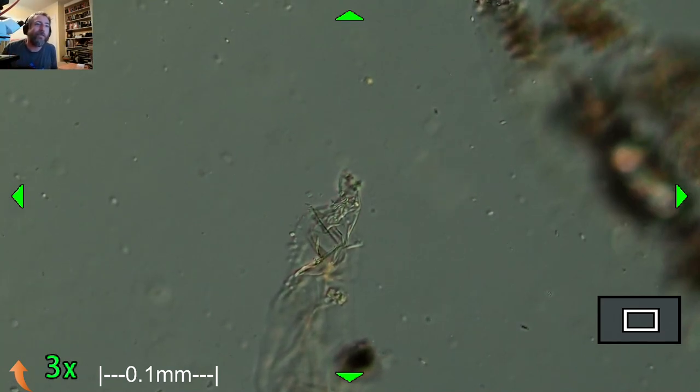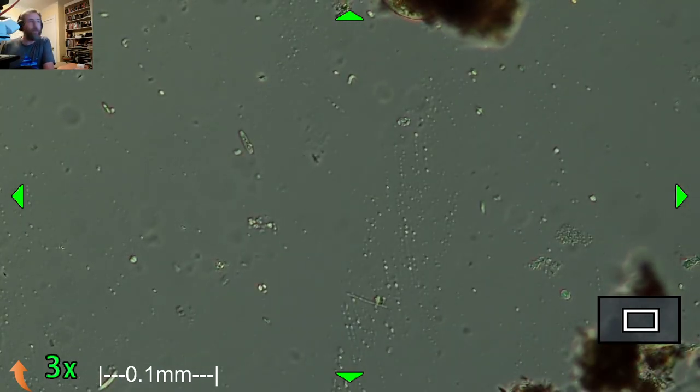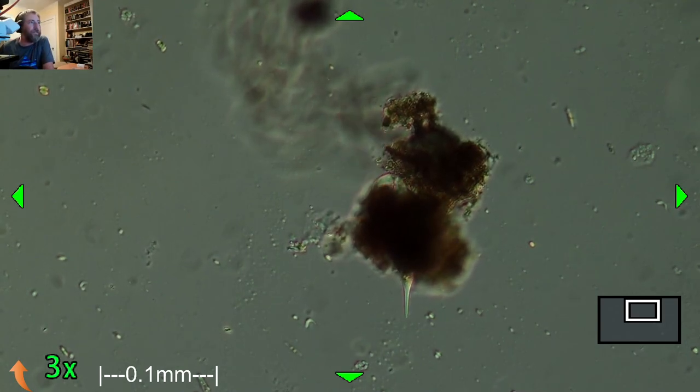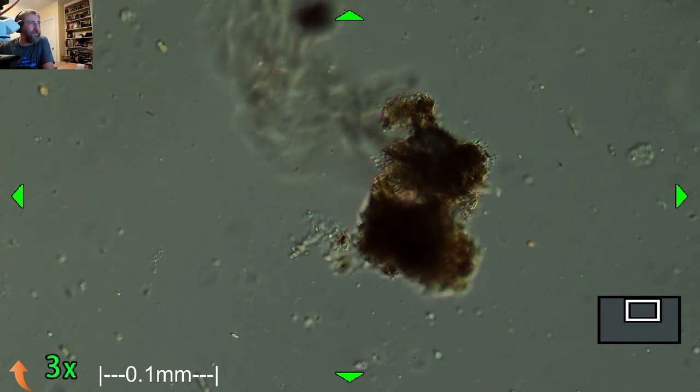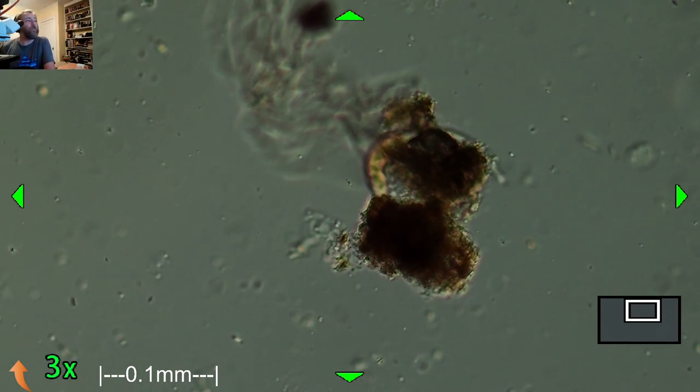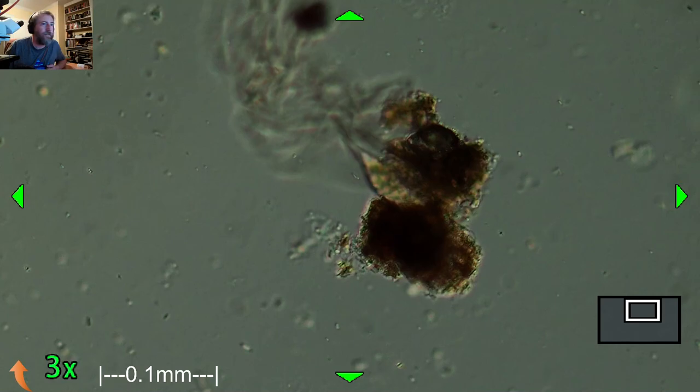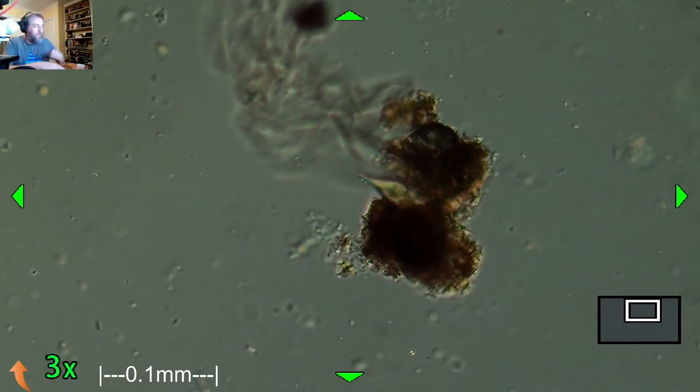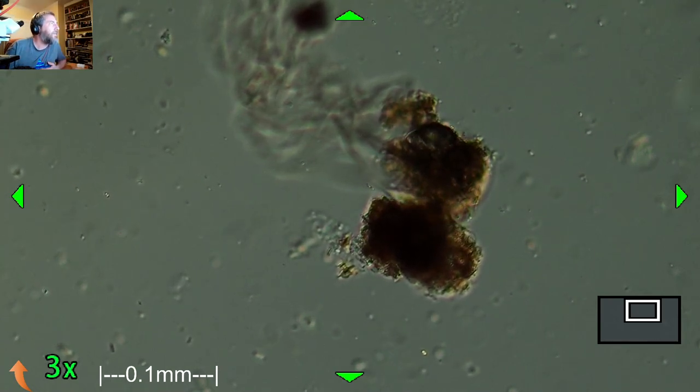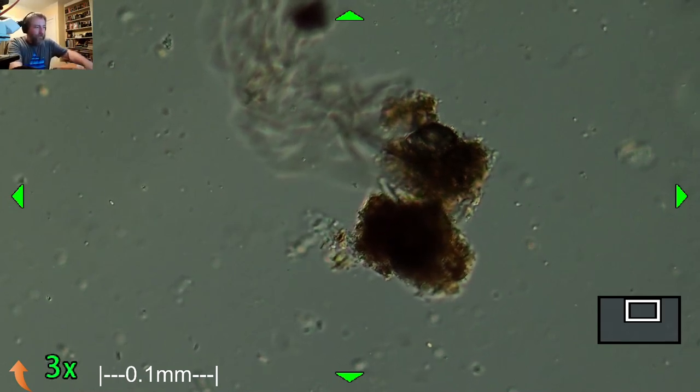Wait, maybe it wasn't Lacrimaria. Maybe it's the other one. Maybe it's the other one. This one's head doesn't quite spin as far. It doesn't stretch quite as much. It's a sort of ribbon-shaped neck. But it has little stingers that can come out and basically grab prey and pull it towards its mouth. Let's see if I can find my book. It looks like I gave it to my wife and now I don't know where it is. He did go south. Thanks, Will. I'll see if I can find him. Oh, it's still here. It hasn't gotten very far. It's just rooting around in the debris looking for something to eat. Dileptus, I think, is what it was called. They are pretty neat. Yeah, Dileptus, that's what this is. Got it.